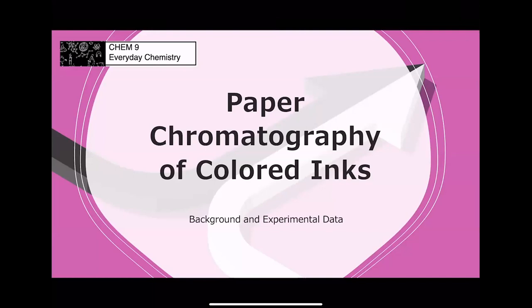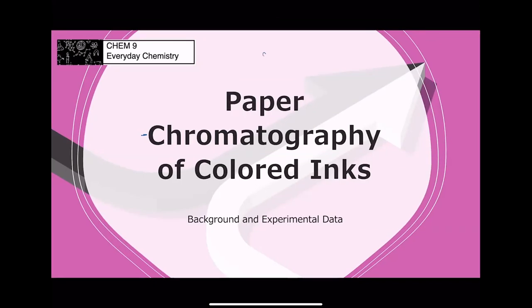So what are we doing here? We are doing a process called chromatography. And chromatography is really important in separating the parts of a mixture. So it's used to separate parts in a mixture. And so we are going to be looking at the mixtures that are these colored pen inks.